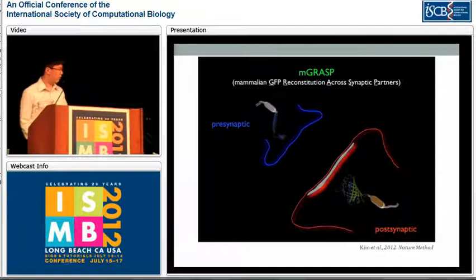Before, the overlap region between the extent of the presynaptic region and the postsynaptic region was used to infer the existence of the synapse, but it's not an actual synapse, it's just a probability. We know that less than half of the axons which pass by a dendrite will form a synapse. Another way to get the synapse locations is to use the electron microscope, but because of the high resolution of the electron microscope, it takes a long time to reconstruct even a small region of the brain.